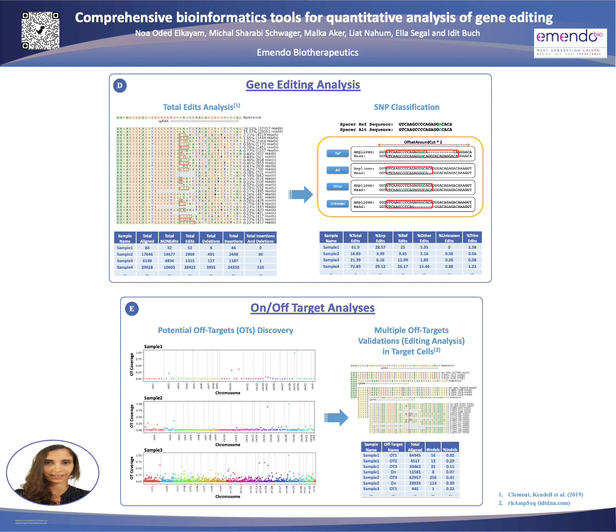As you can see in the reads themselves, sometimes the SNP is deleted after the repair mechanism, or the SNP identity is not one of the 2 expected nucleotides in the heterozygote cell. It is neither the ref nor the alt. We report the counts of each of these scenarios to give a final discrimination score.